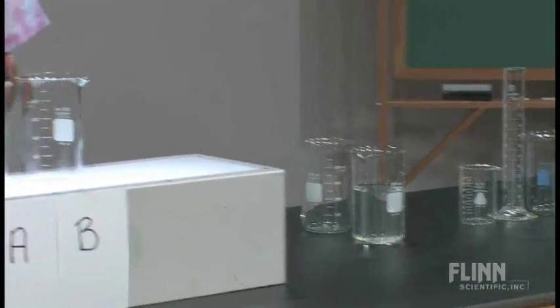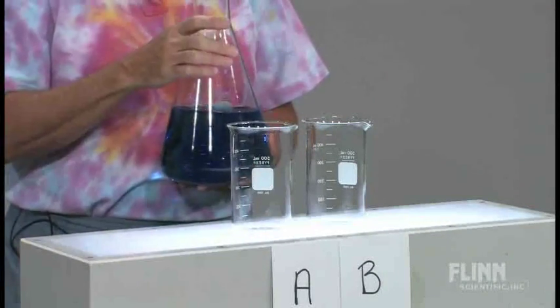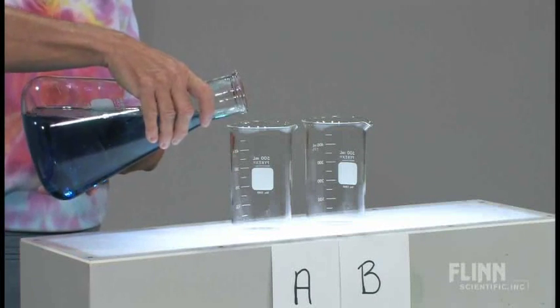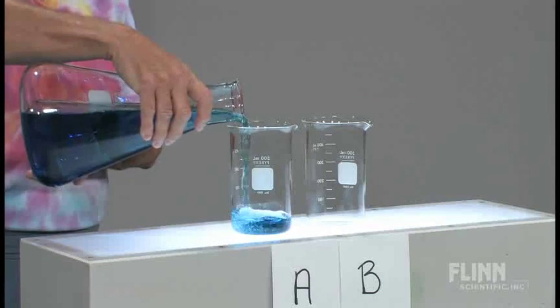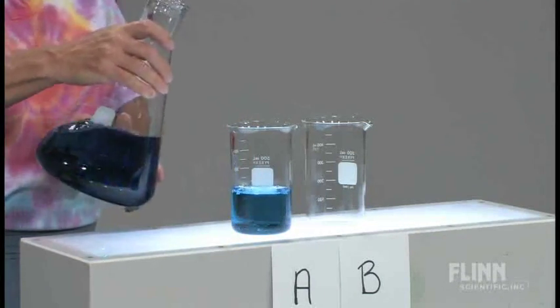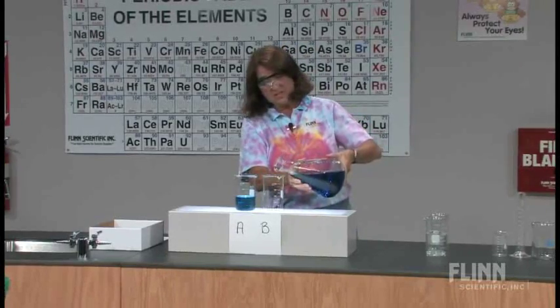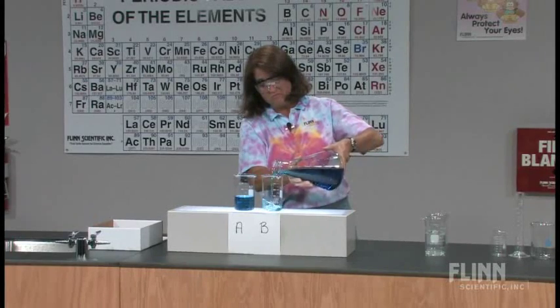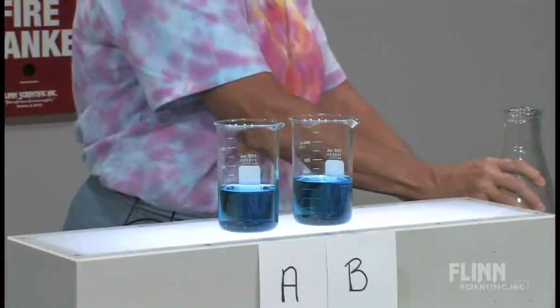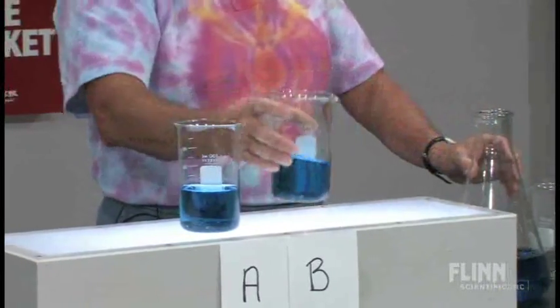Now I'm going to take this and pour some of the liquid into each of beakers A and B, roughly 200 milliliters. It makes a lot of sense that no matter what the concentration of the solution is, since I'm pouring it from the large Erlenmeyer into the smaller beakers, it's still the same solution. The concentration and appearance of the solution, as far as color or intensity, shouldn't change.